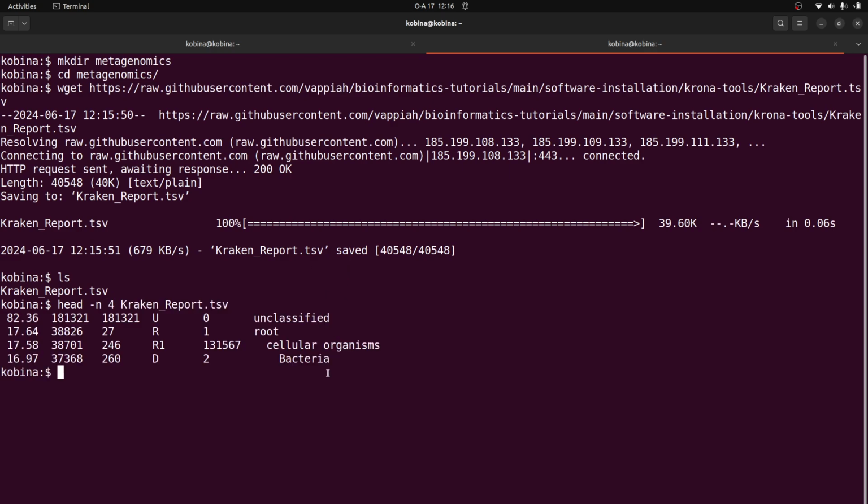this to get some of the information, the contents. Okay, so there's a Kraken 2 classification report. We have it something like this. That's fine. Now we need to visualize using Krona. So you have the file already here.